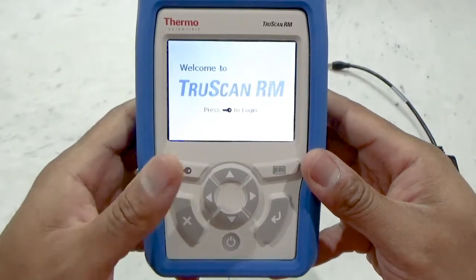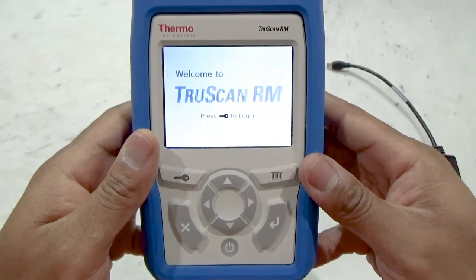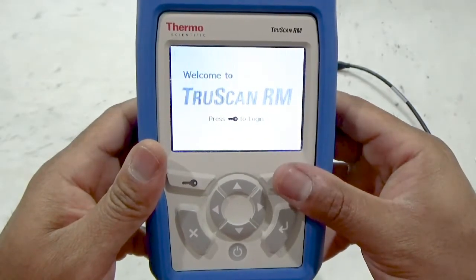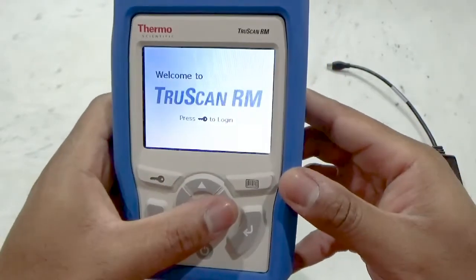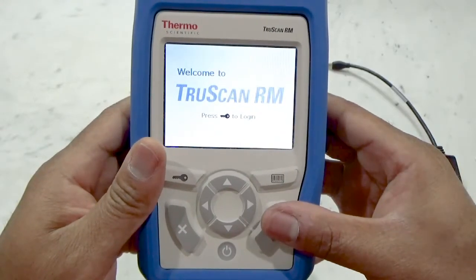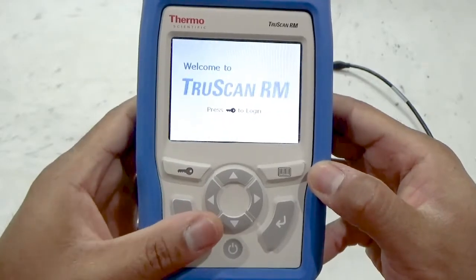The login/log off button so users may access the instrument throughout their shift. The barcode button that activates the barcode reader to take a scan. The four-way directional pad that is used to navigate menus and the on-screen keyboard. The enter key that makes menu confirmations or progresses into new menu screens. And the cancel button that allows a user to back out of menu screens.